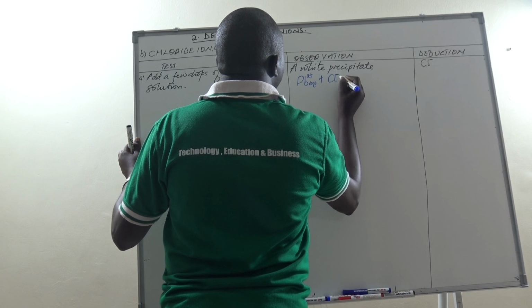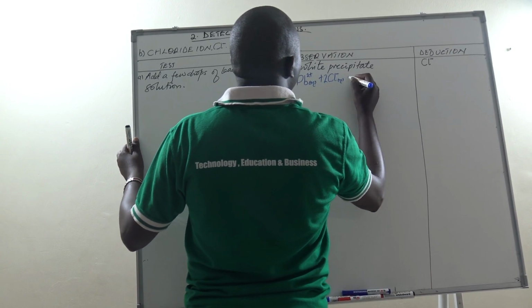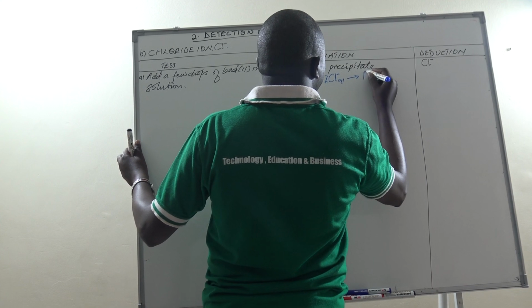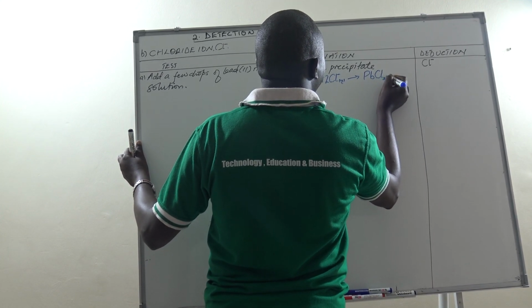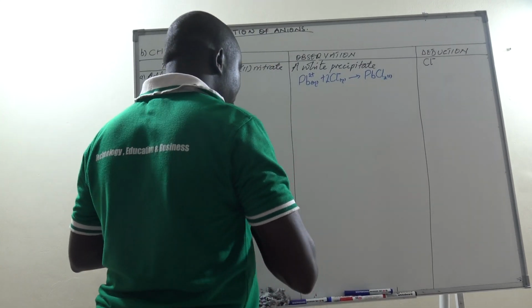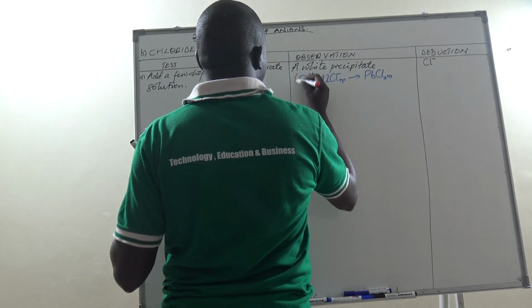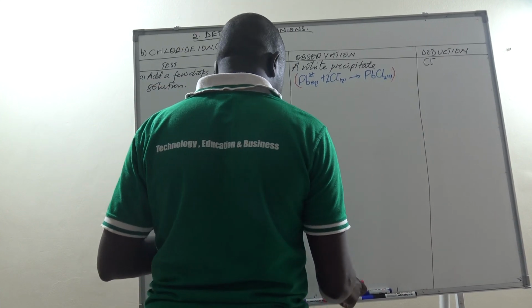Since chloride ion has one negative charge, we have to make it 2, and then it will combine with this divalent cation, the lead(II) ion with 2 positive charges, and we get lead(II) chloride, which will be precipitated, formed as a solid, and we get a white precipitate, as we had seen earlier with sulfate ion. So this is the reaction equation involved.